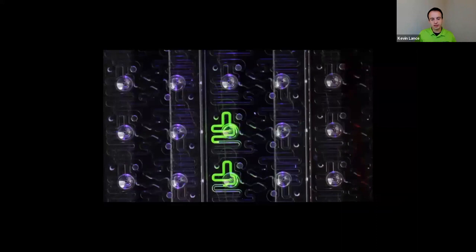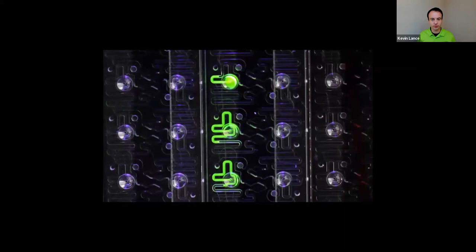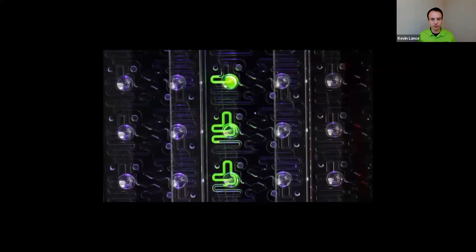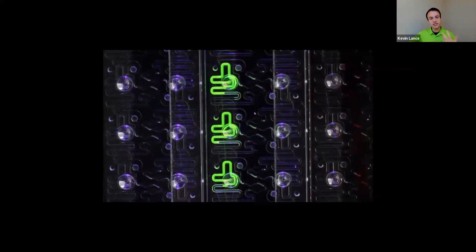What this looks like when we're pipetting in a sample — shown here in real time — is simply added into the well, and things are drawn in on their own. The sample is then ready to sit for up to two hours without worrying about evaporation, and there's no need to clean analytical techniques between samples. You're just ready to read your plate on Stunner when you need to.